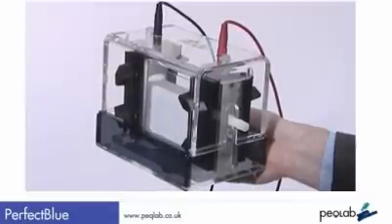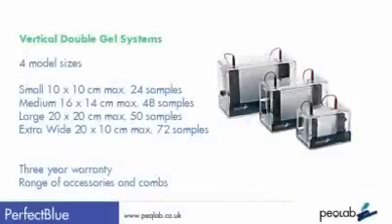Perfect Blue systems accommodate many of the available precast gel sizes and are offered in four model sizes: small 10x10cm, medium 16x14cm, and large 20x20cm, plus the extra-wide model which can accommodate up to 72 samples.